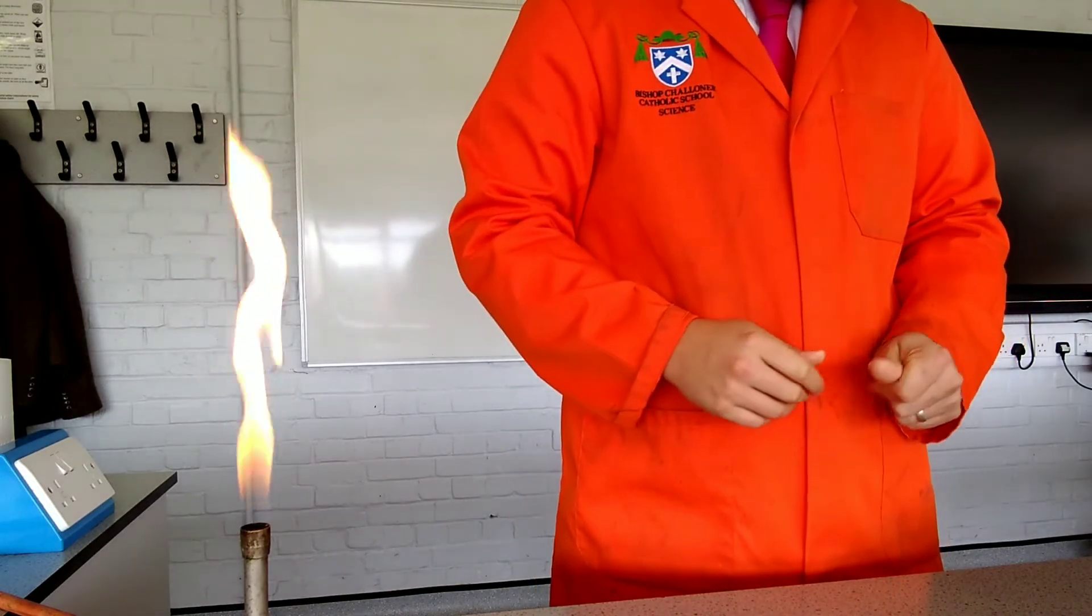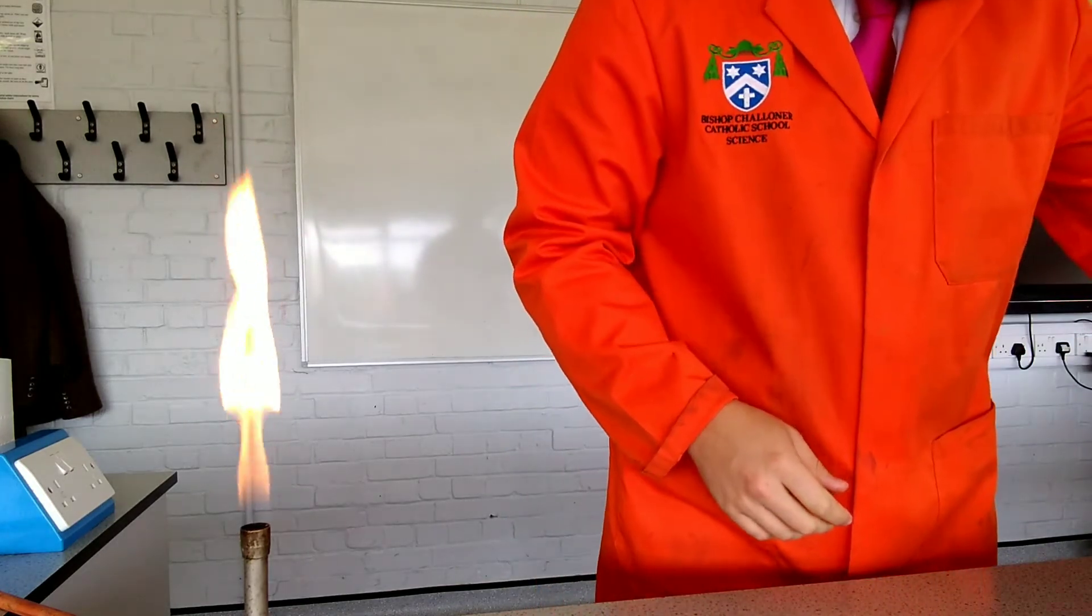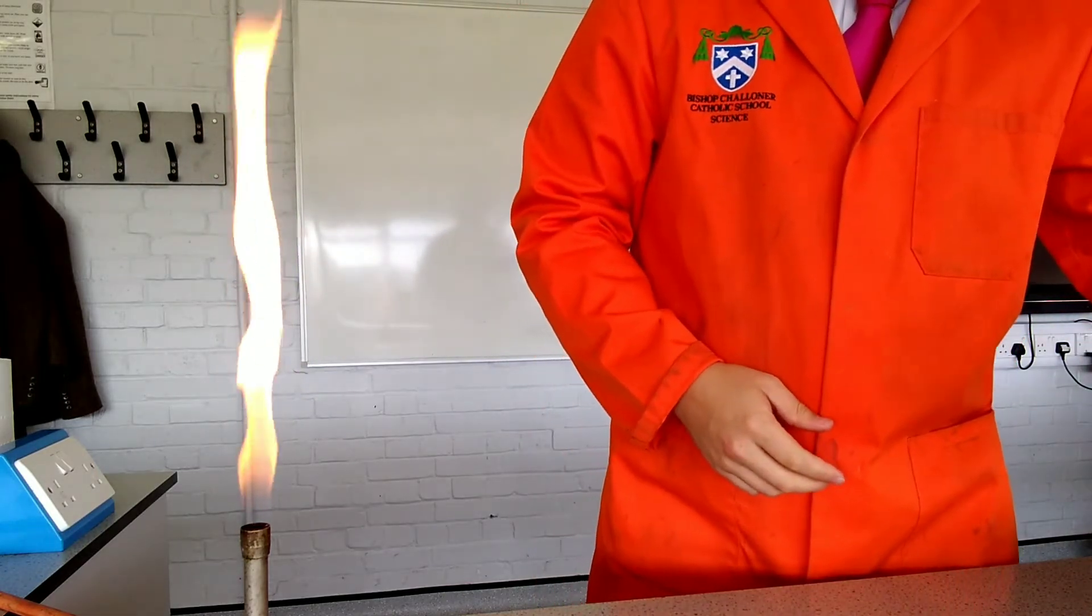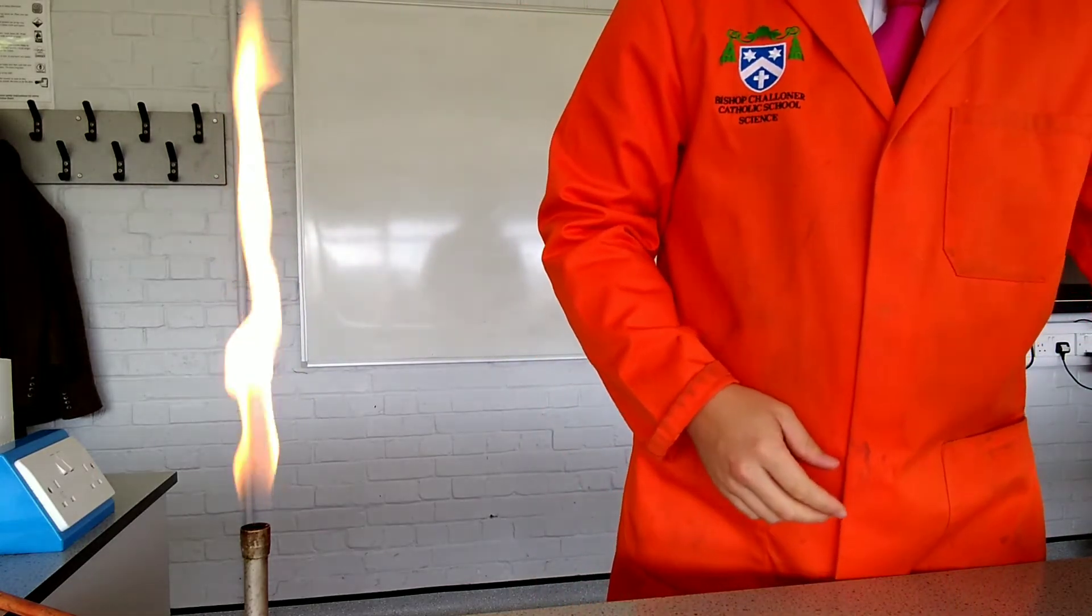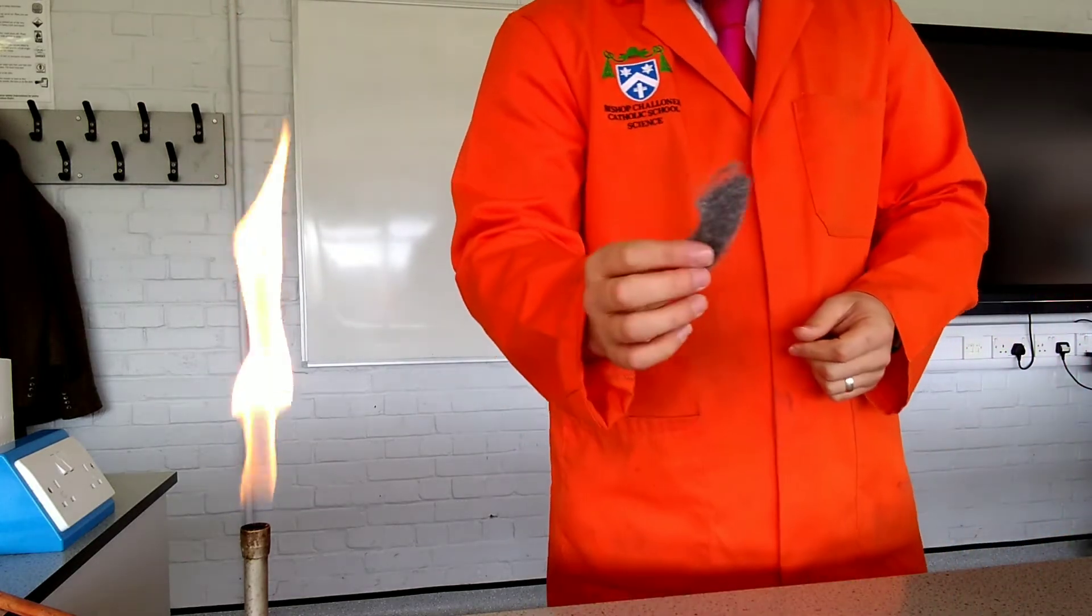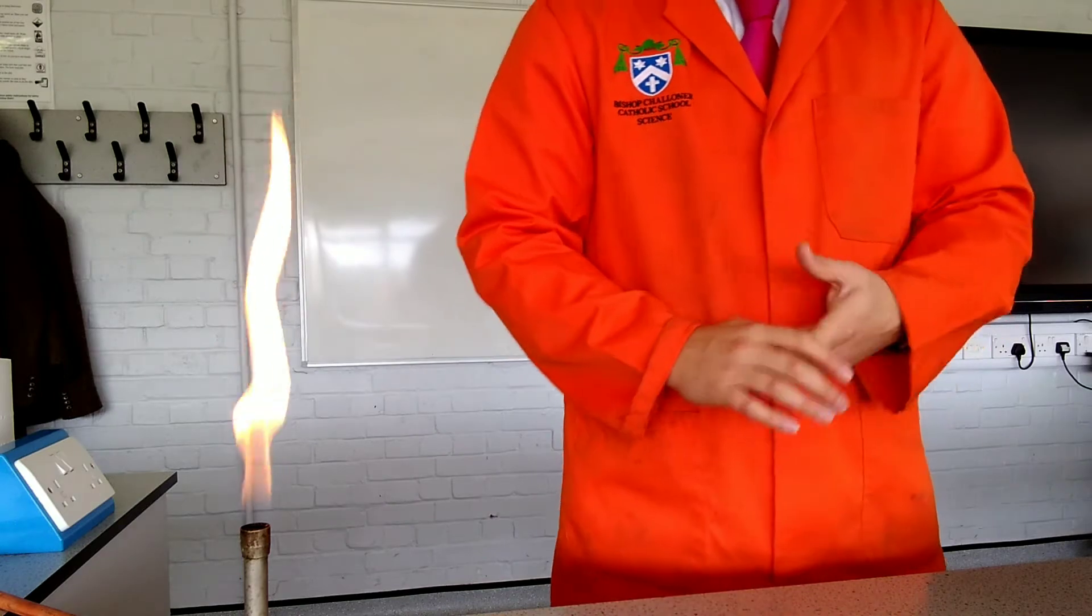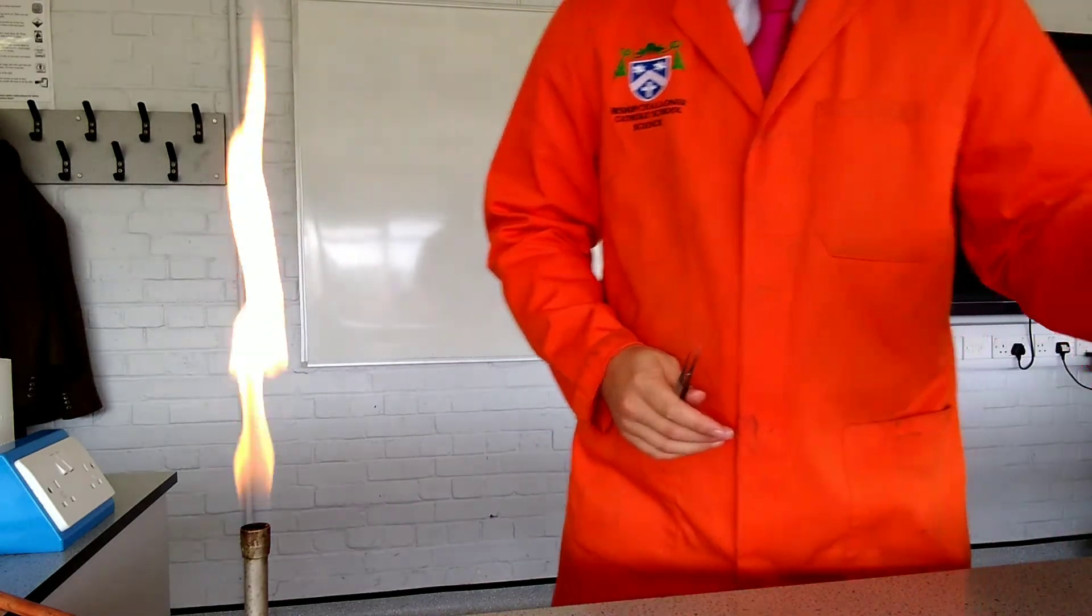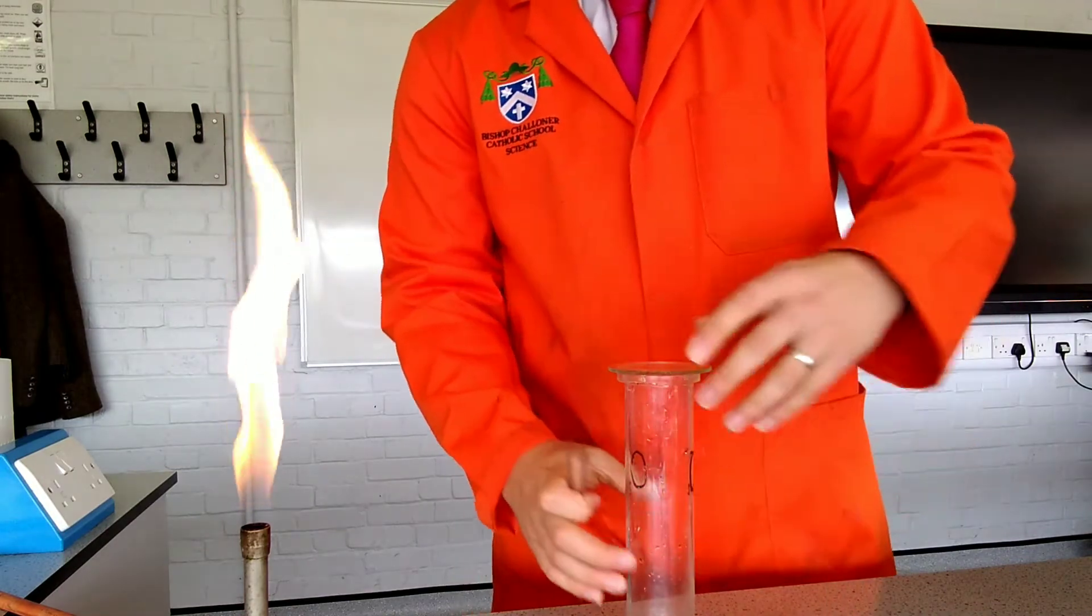Next up, we're going to have a look at iron first instead. So here's iron. I'm actually going to use some iron wool, and I'm going to set fire to my iron wool and then I'm going to place it into another jar of oxygen.